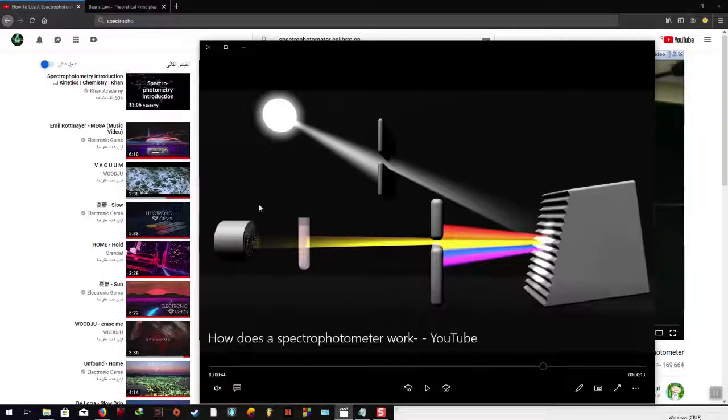The absorbance will not be affected, because if we didn't do this and directly added the sample, there would be absorbance not only by the element we are trying to measure, but by other elements in the blood. This will raise the absorbance, which will give an error, raising the concentration erroneously, and that is not the absorbance we should take.